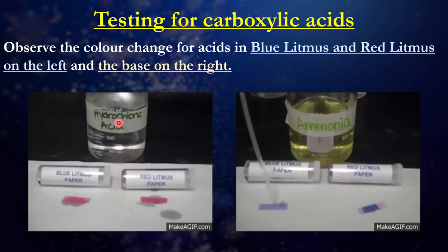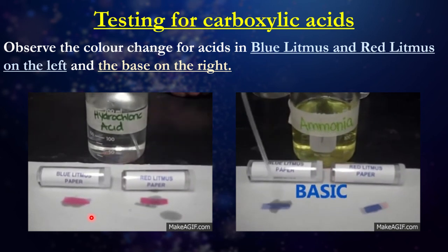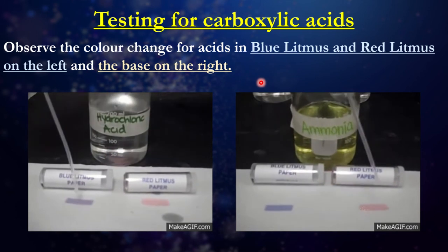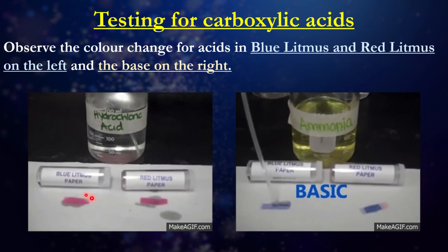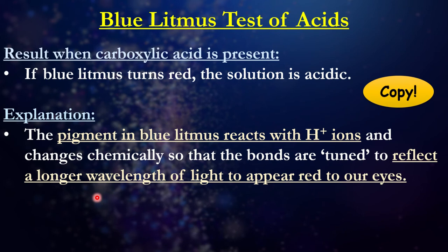Whenever an acid reacts with blue litmus paper, it will turn red. The same thing will occur with a carboxylic acid. So a carboxylic acid will turn blue litmus paper red, and that's how we can test that we have the carboxylic acid there.